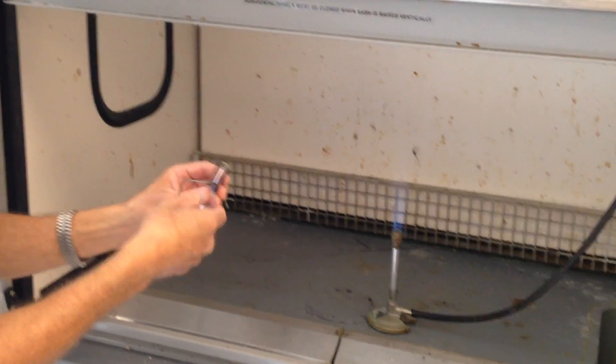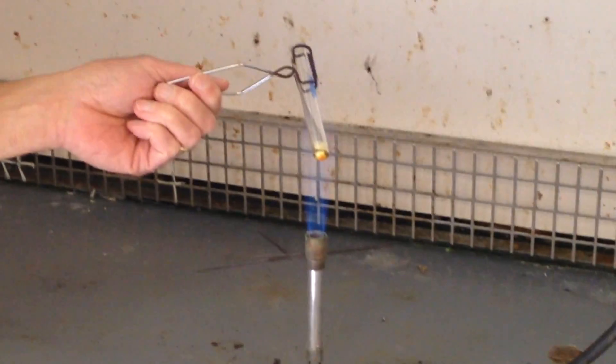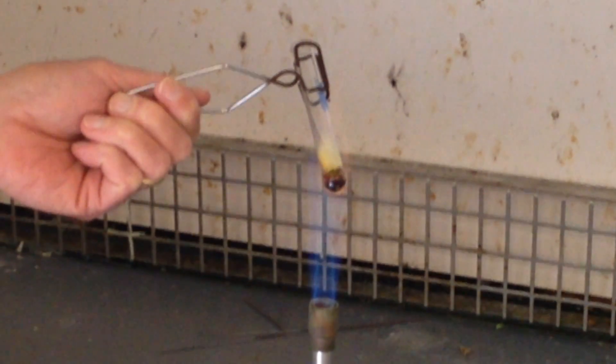Now we will heat the combination in the hottest part of the flame. The first thing you'll notice is the sulfur starting to melt — you get a yellow and then a darker reddish liquid forming.